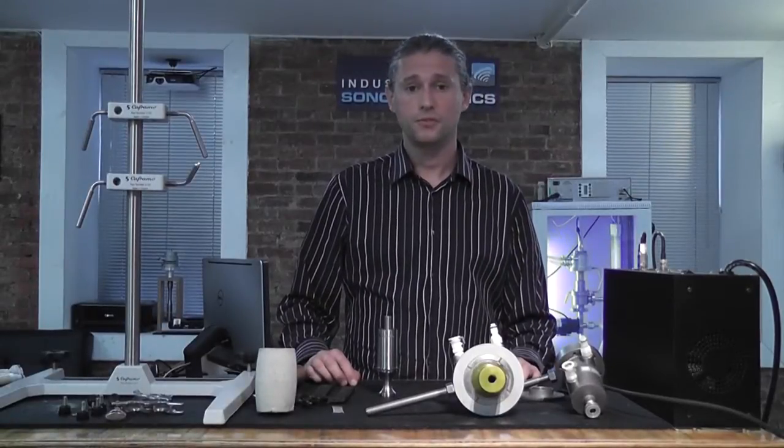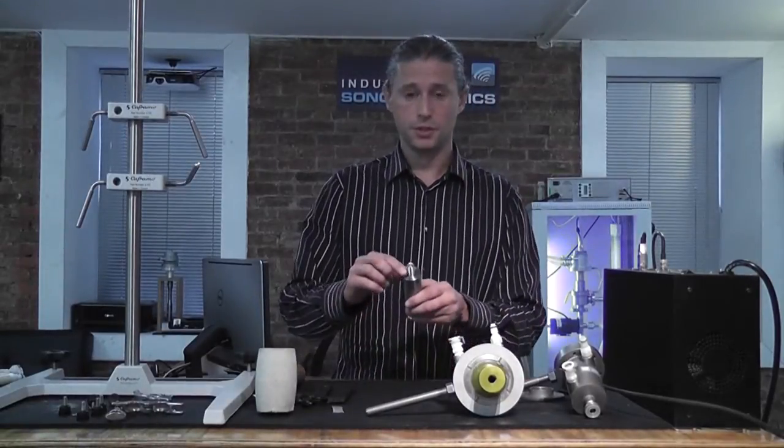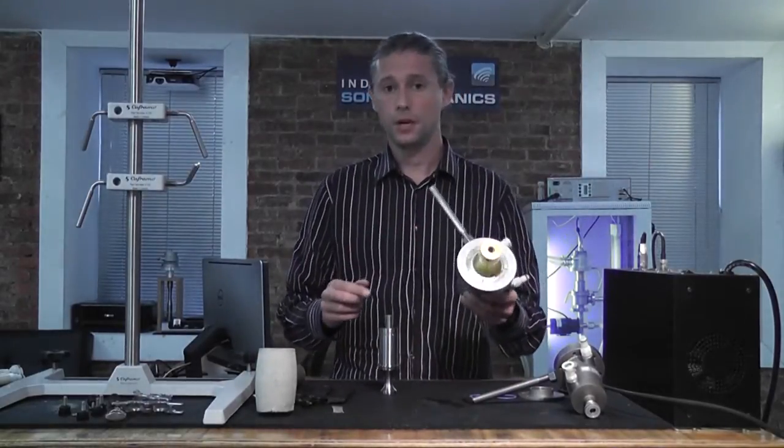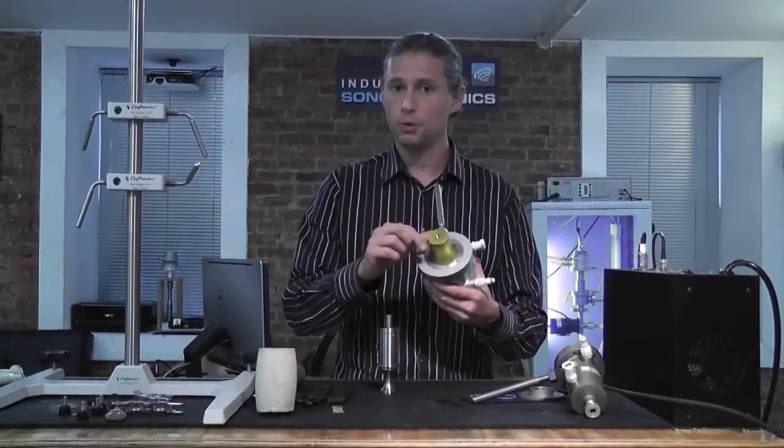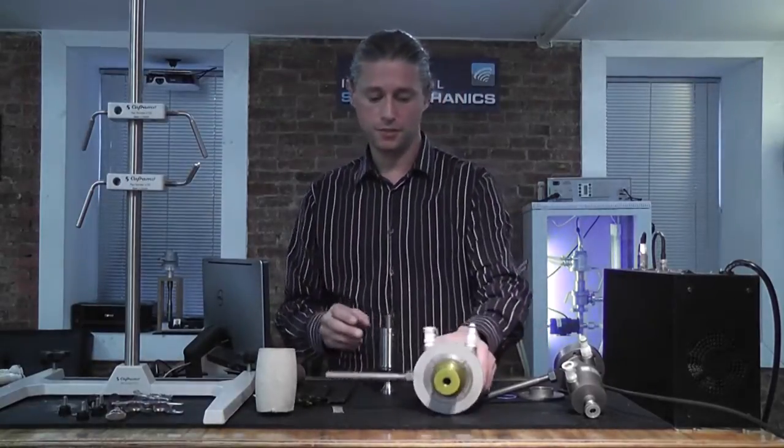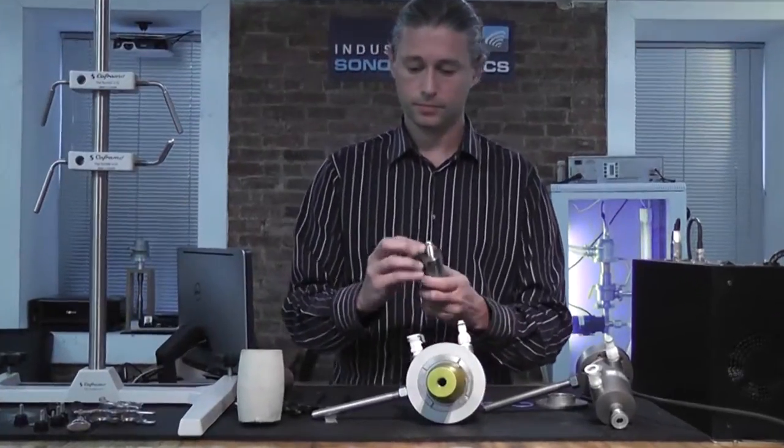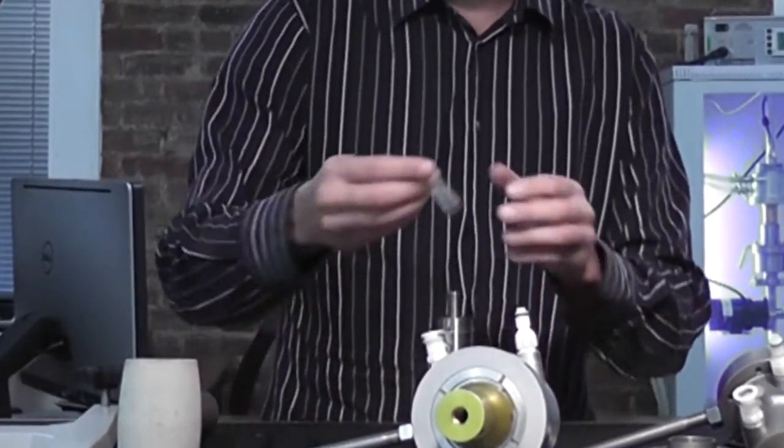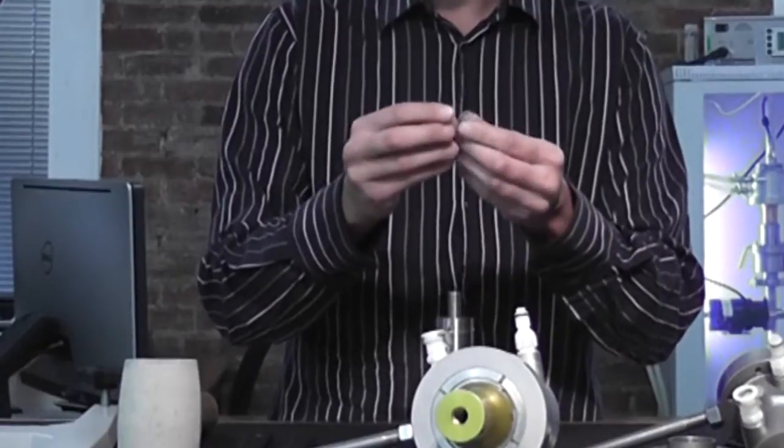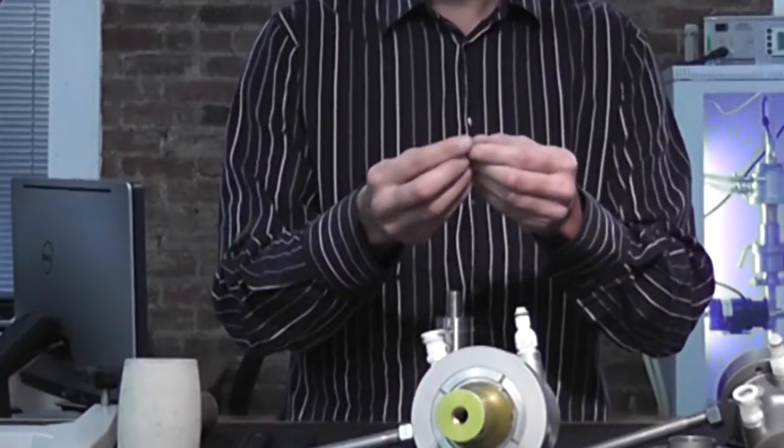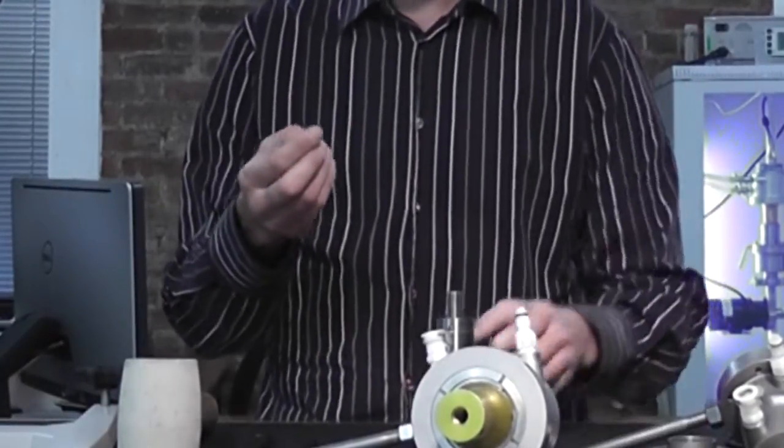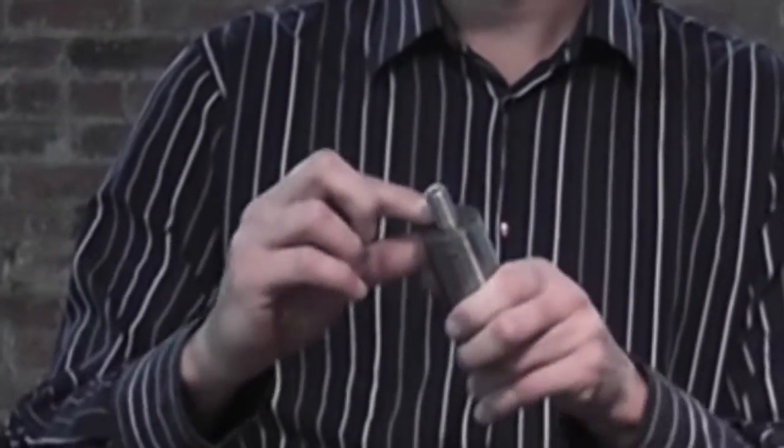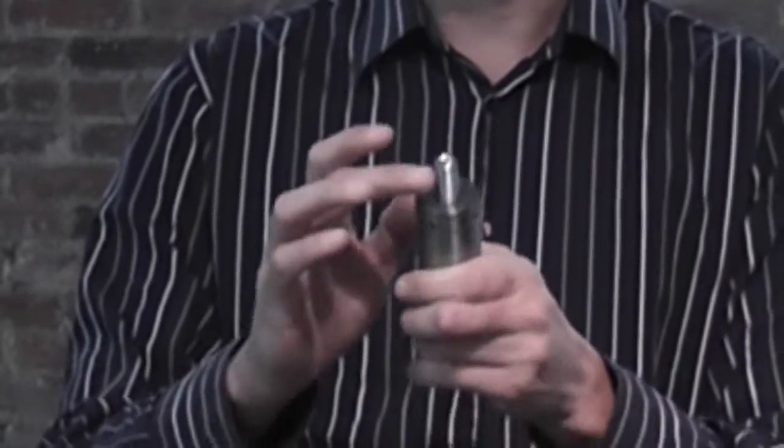To assemble the system, first make sure that the mating surfaces of the horn and the transducer are completely clean. There should be no particles, nothing that can scratch these surfaces. Next, use a small amount of silicone grease on your finger and spread it on the horn's mating surface evenly, but not on the bolt.